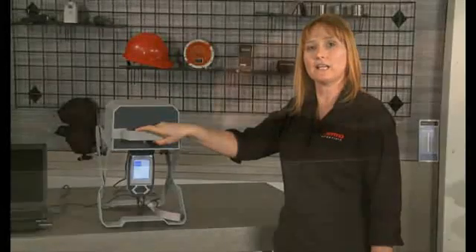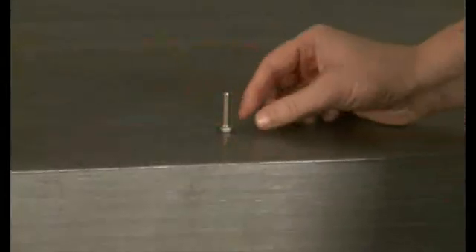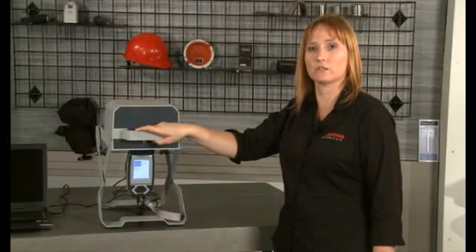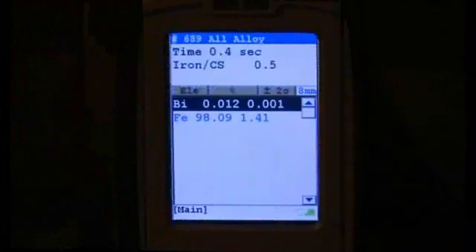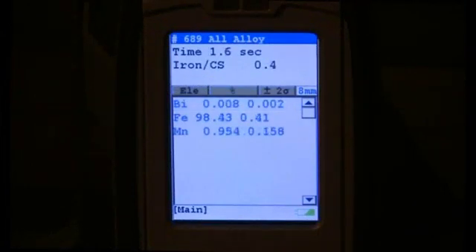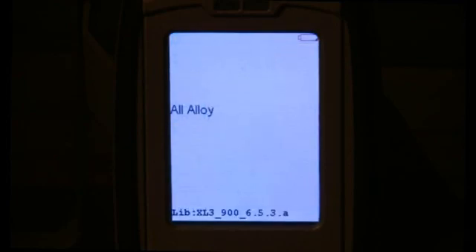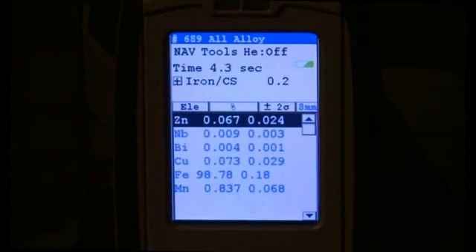We can also notice a slightly off-color yellowish tint to the coated area that is not typical of a clean steel surface. Any iron or steel containing only carbon as the alloying element will be identified as iron/carbon steel to indicate that we cannot test for carbon and therefore do not distinguish between pure iron and steel with carbon content.